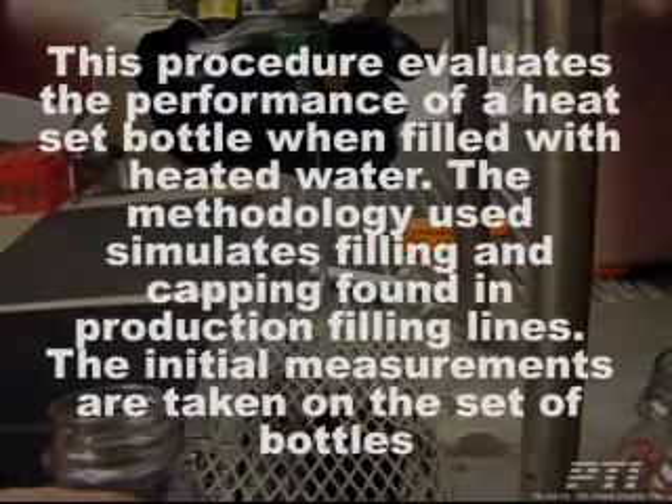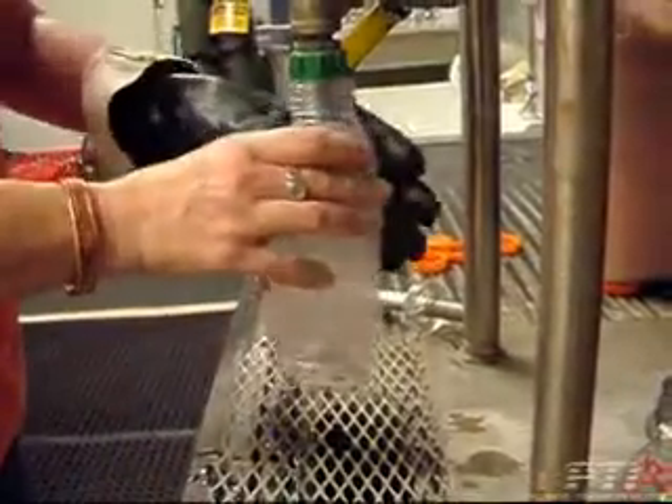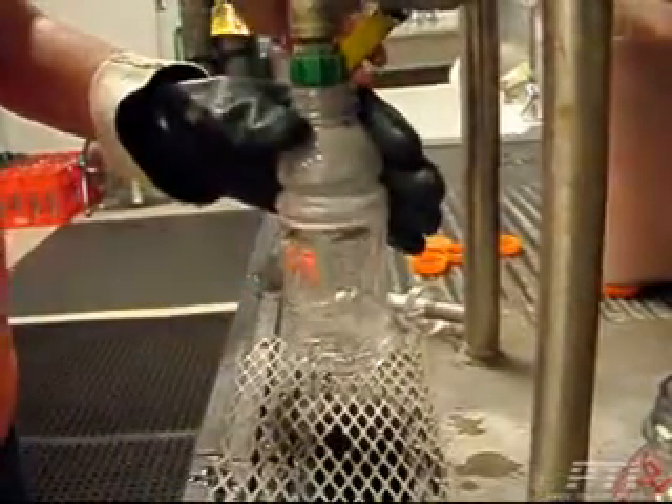The initial measurements are taken on the set of bottles. The bottles are then filled to the top of the sealing surface with water that has been heated to a predetermined temperature.